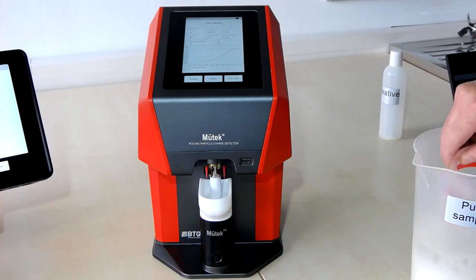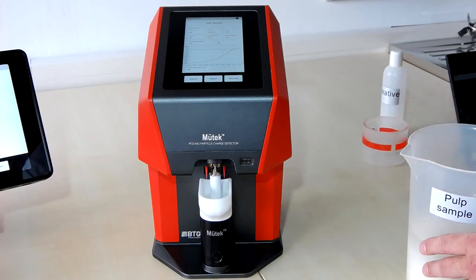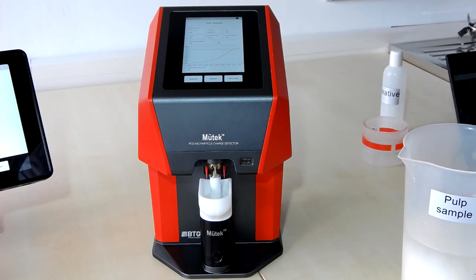And we already got a first result from the PCD. We are measuring a cationic demand of minus 0.11 milliliter. So let me enter this into the Excel file.